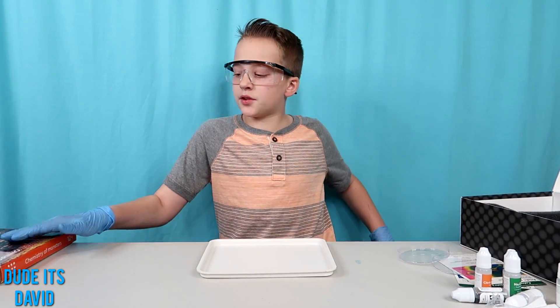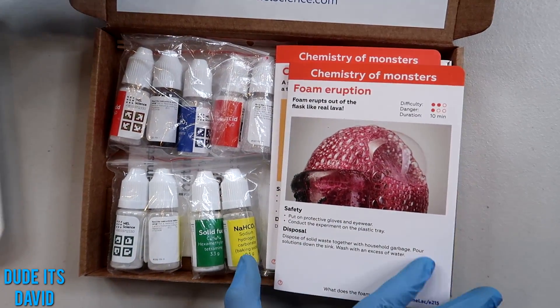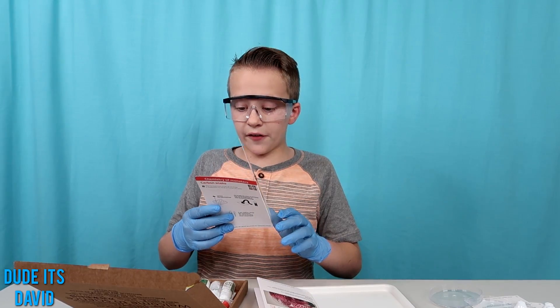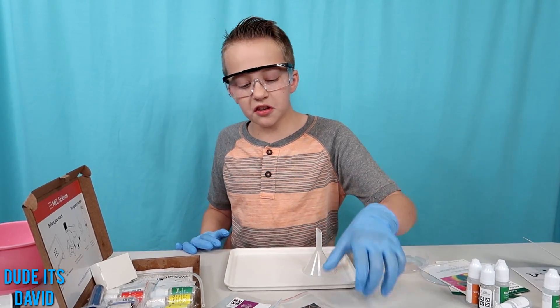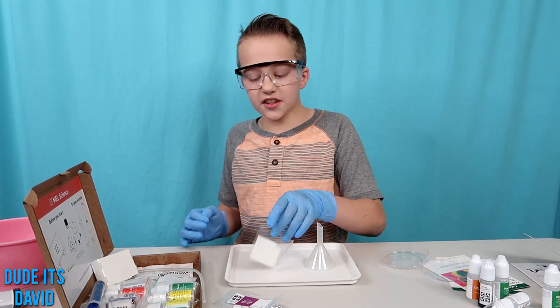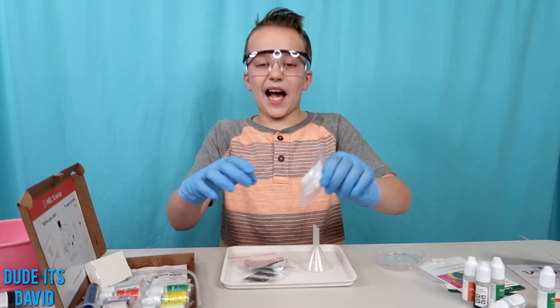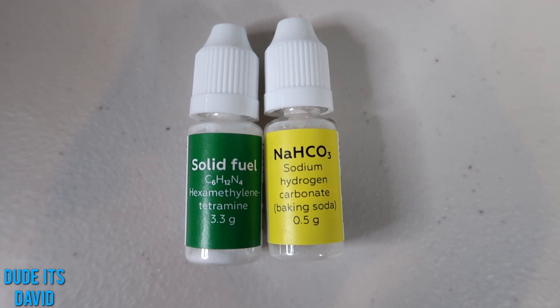Let's check out our next chemistry kit. Look at my home lab — it's so cool. Foam eruption, and carbon snake — I'm definitely doing this one. We're going to need a lot of stuff for this project: a funnel, some special stickers, a spoon, foil, calcium gluconate, baking soda, and solid fuel.